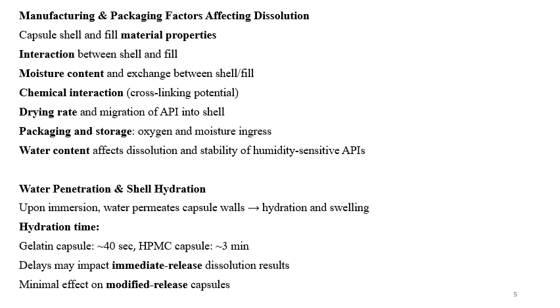Upon immersion, water penetrates into the capsule walls; it hydrates and swells. Hydration time is typically 40 seconds for gelatin capsule shells, and for HPMC capsule shells it is around 3 minutes or up to 3 minutes or less. Sometimes it may be more, depending on the capsule.